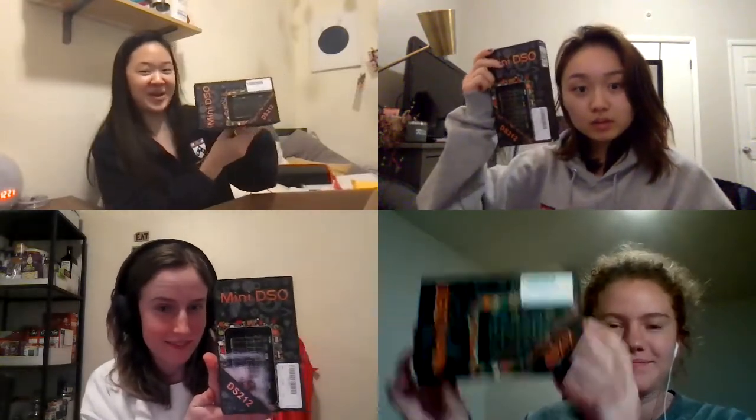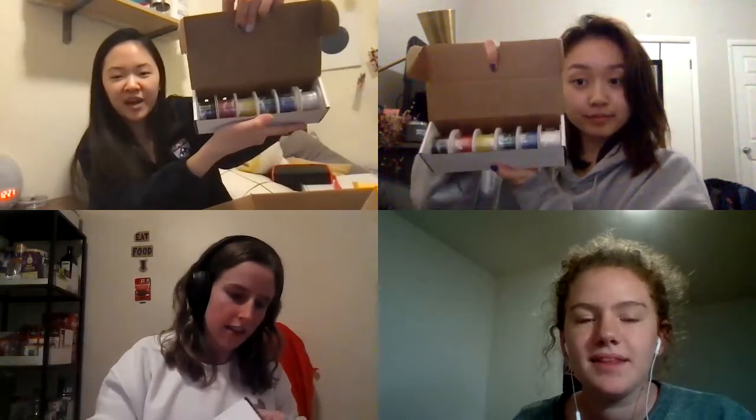I don't know what this is exactly, but that's everything for spectrophotometry — all ready for tomorrow. We also have other things to quickly show: bio electrodes, an oscilloscope — oscilloscope! It has a 10 MHz sampling rate, two channels, and one wave out, four hours working. It looks really cool.